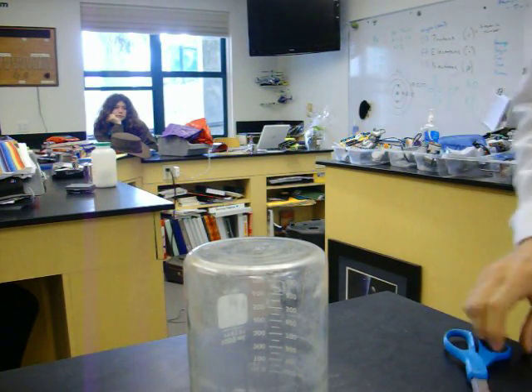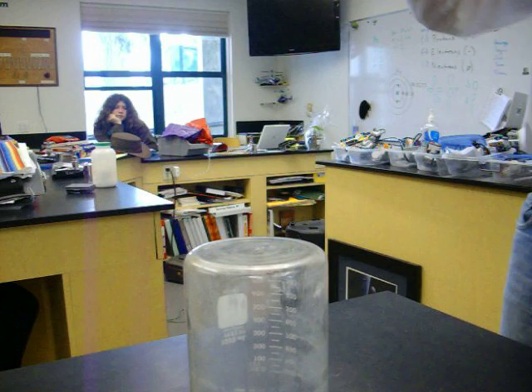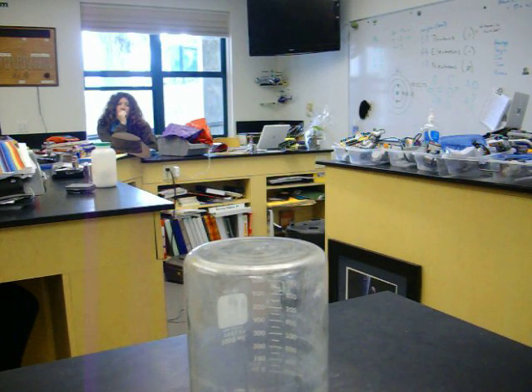I know the beaker is upside down. We're going to pour the solution into the beaker. What we need to do is very carefully snip off the edge, and if the reaction starts, it'll start.